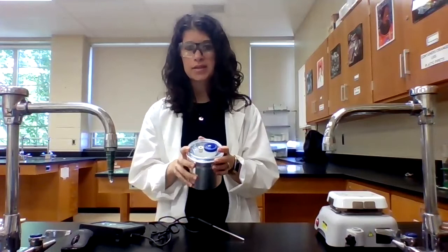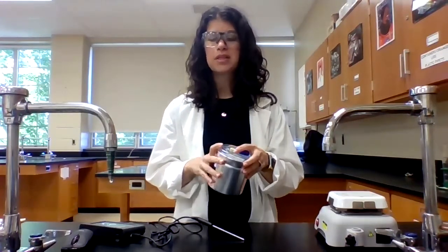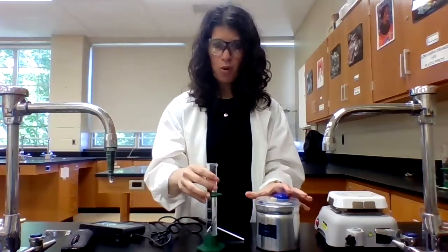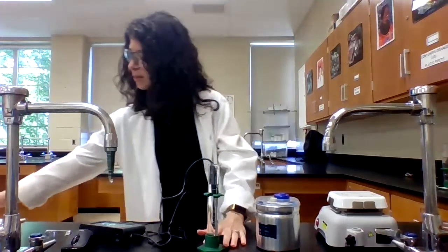Now, before I start doing the 3 different reactions, I do need to first determine the heat capacity of the calorimeter itself. In order to do this, I'm going to take some room temperature water and some hot water and mix them together, and then monitor the temperature every 20 seconds for 3 minutes. So I have some room temperature water here. I do need to know that initial temperature, so I'm just going to insert my temperature probe there and record the temperature in my lab notebook.